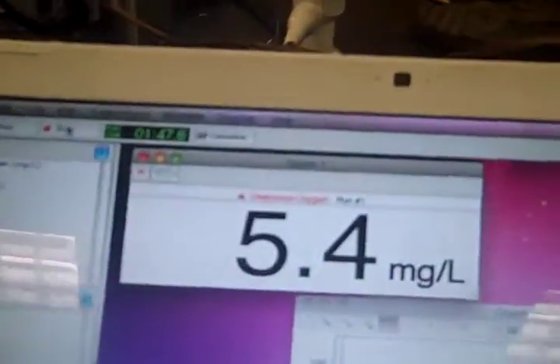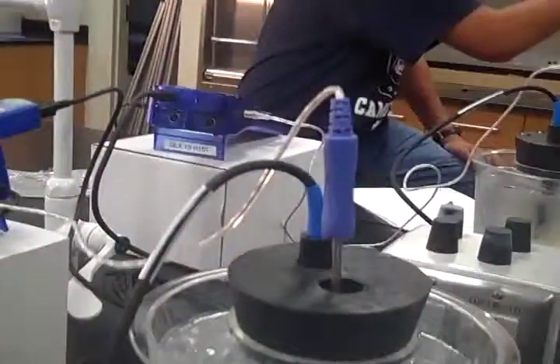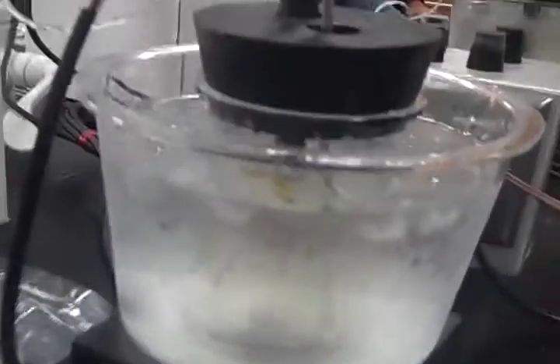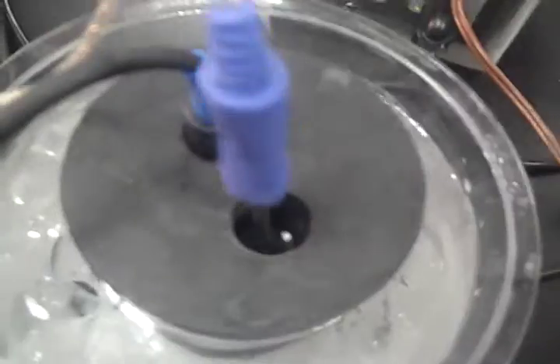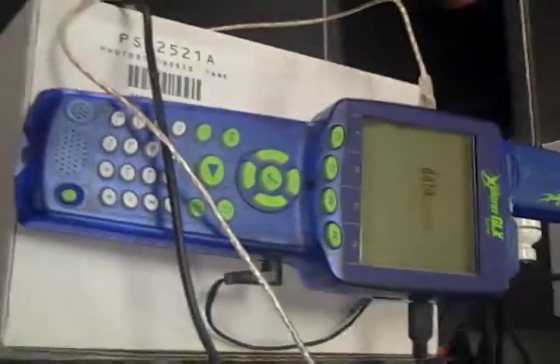Alright, hey, my name's Mario, and this is APES, period 6, and we are monitoring the conditions of the tank. If you point at the, it's 5.4 milligrams, we can see that there's a probe, and that's a probe, and then there's a stirring thing, and that's ice water around, and in the middle you see there's a cup or a glass, and yeah, so that's our data studio.